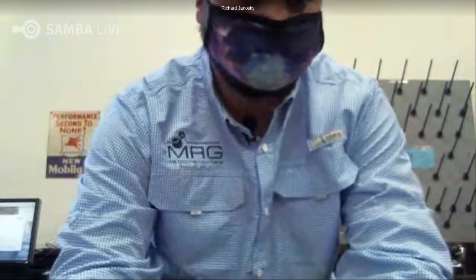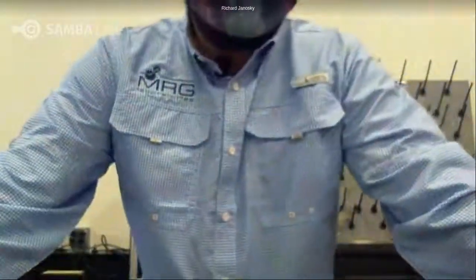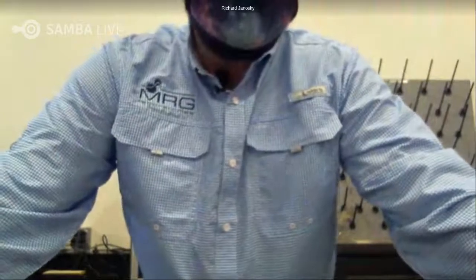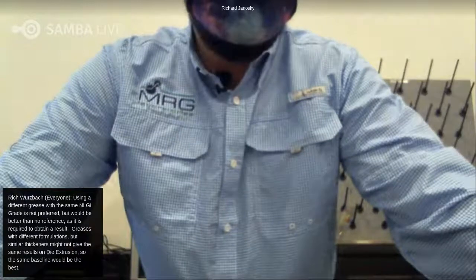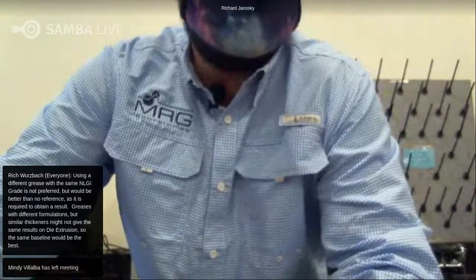Just told I missed one question that got out in the chat. All right, that's a very good question. What if we don't have a reference sample to compare results? Can we have valuable information without a baseline, or by comparing the grease with a similar fresh grease that has the same NLGI grade and thickener type?